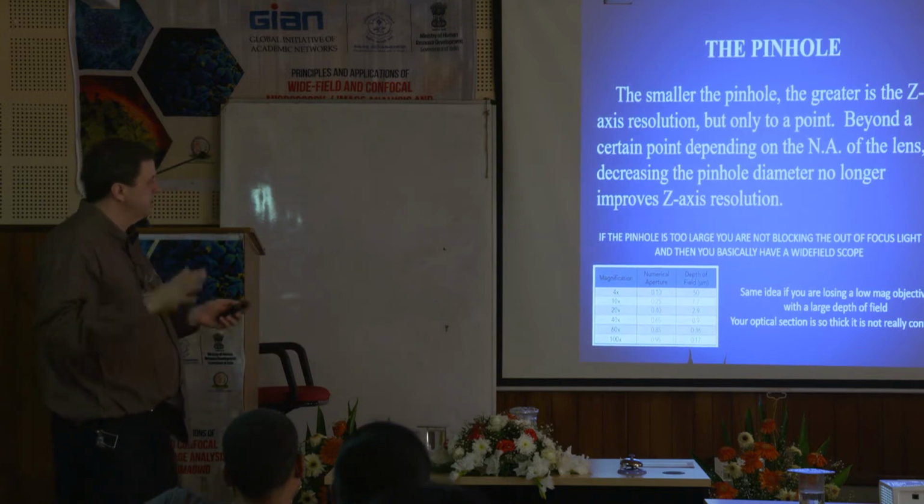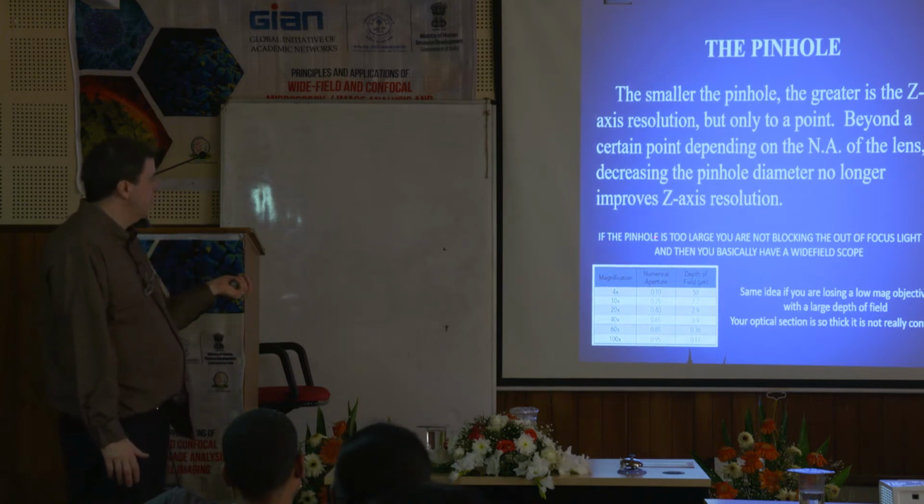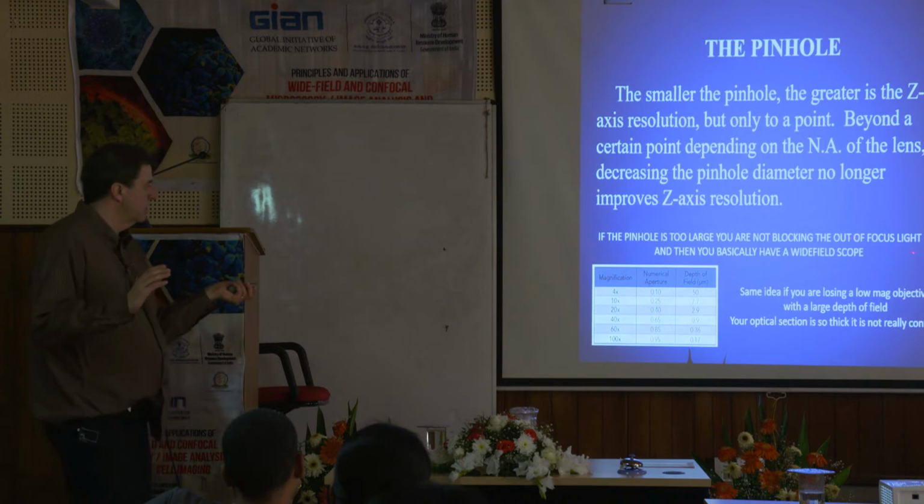But let's think about this a little bit. Let's think about the theory here, what's going on. If the pinhole is really, really big, you're really not blocking out the out of focus light.